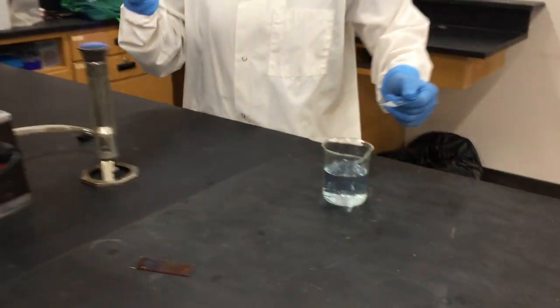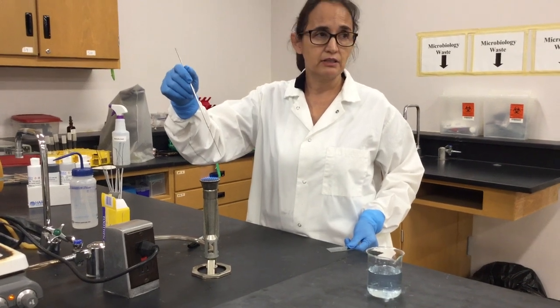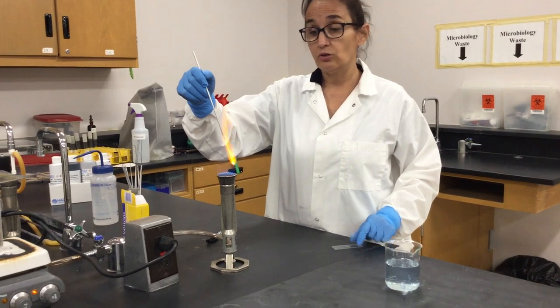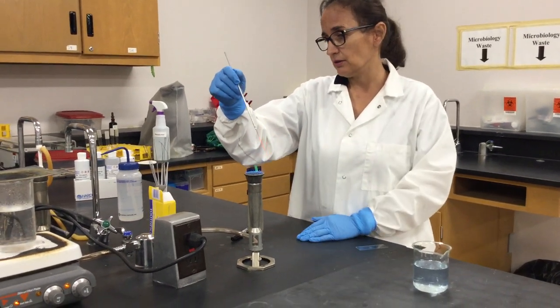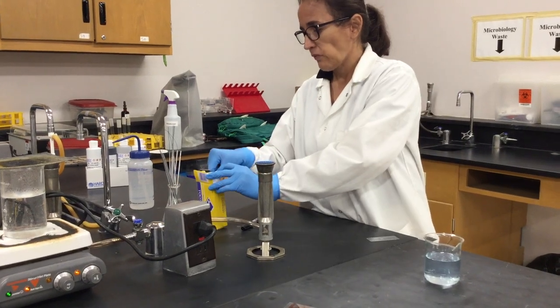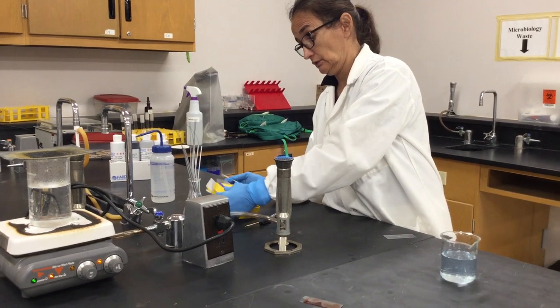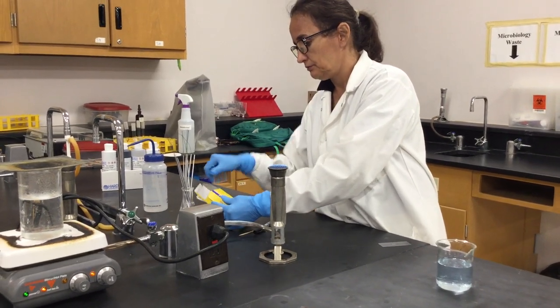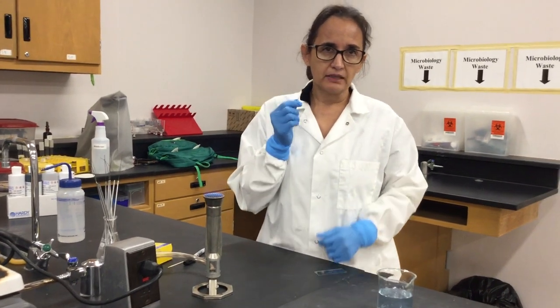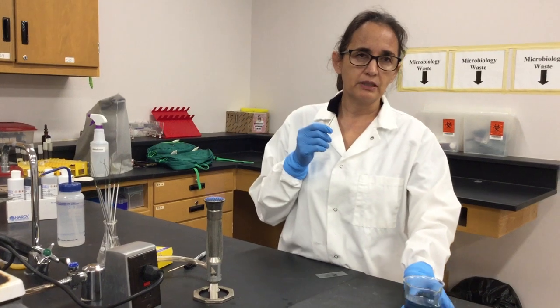And then you want to sterilize your loop, because of course you don't know if you previously had bacteria on this loop, so you sterilize it again and put it on one side. You don't need to use this in your mouth, of course, at all. So you put it here, and the preferred area for grabbing bacteria from your mouth is the second superior molar, because this is the area where we have more bacteria.